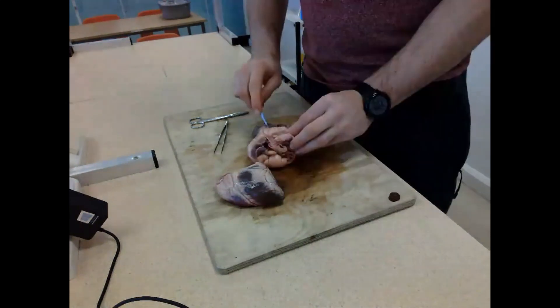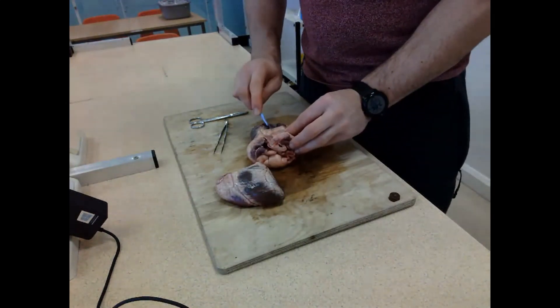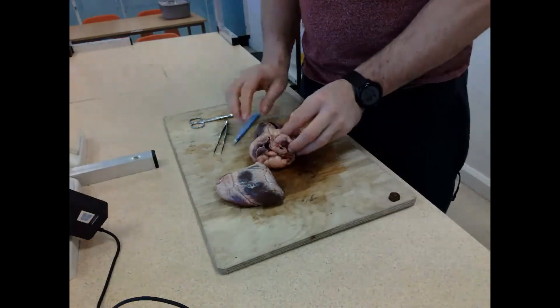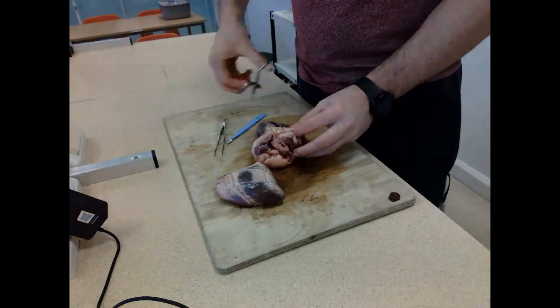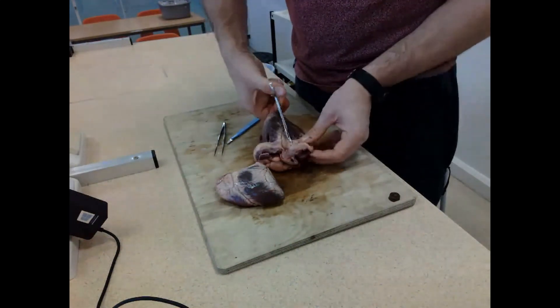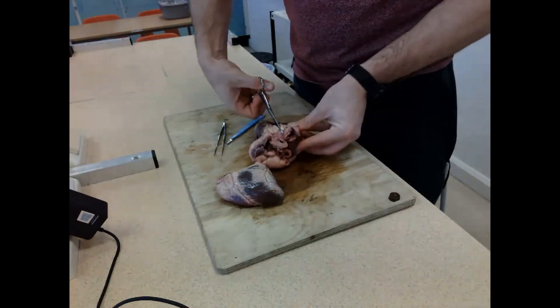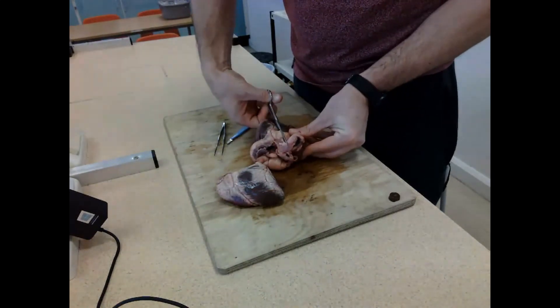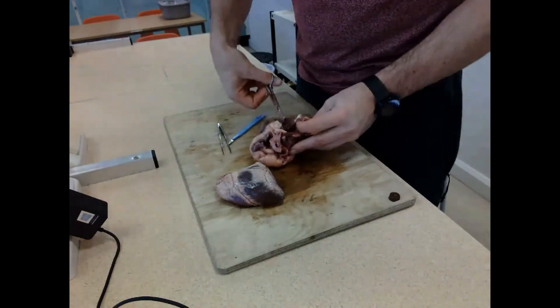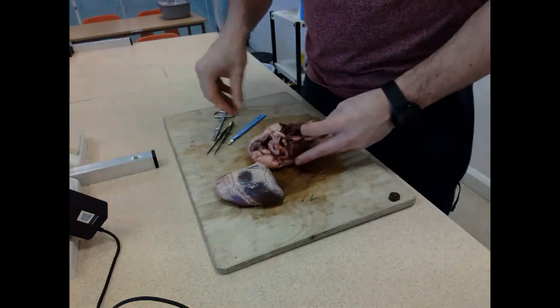Now I'm going to cut through the heart and show you the thickness of the two walls. As you'd know, the left hand side is far thicker because it's pumping blood around the entire body, whereas the right hand side is only going as far as the lungs. I've got the scissors out to cut it all open and really emphasize just how thick this wall is.